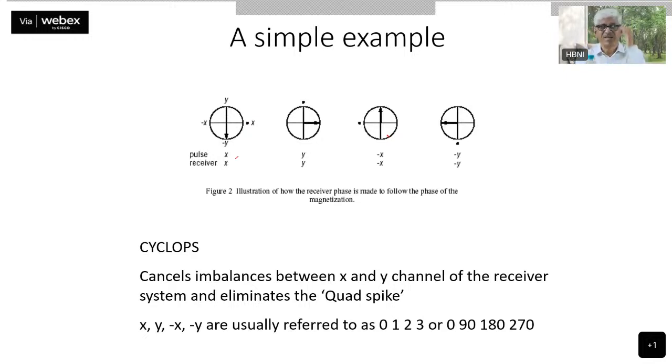So what is the meaning of phase 90 degrees apart? Whatever radio frequency you apply to a transmitter, which is a sine wave or a cosine wave, it has a certain phase. Now the same signal, the same RF, is fed to the receiver also.